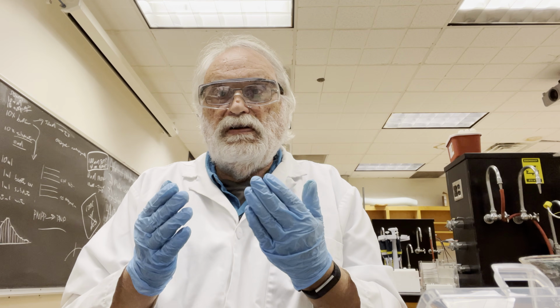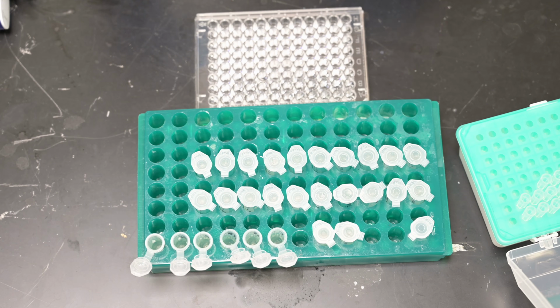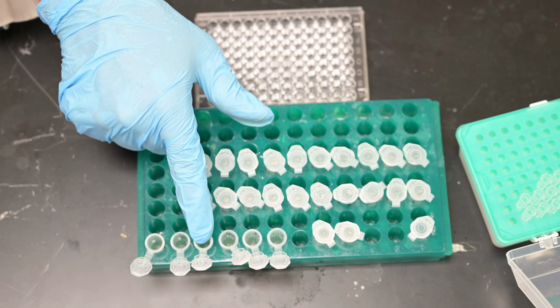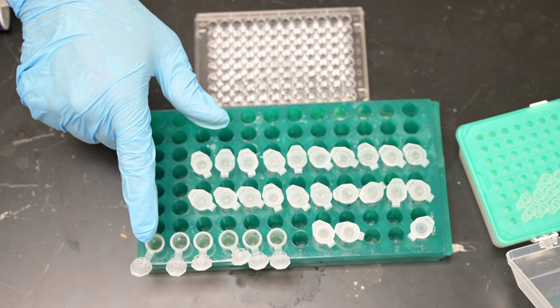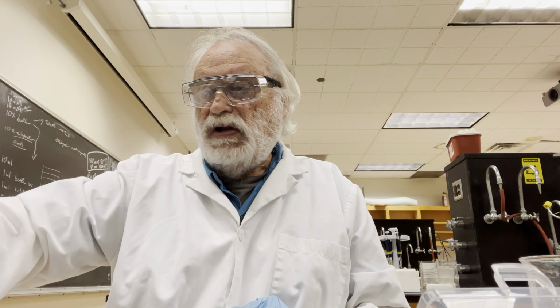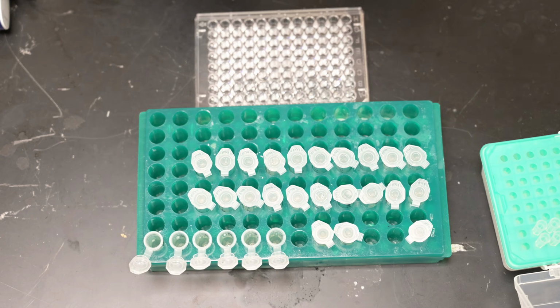The standard concentration of BSA that we have in the solution is 2 milligrams per mil. So I set up a series of tubes labeled 1, 0.5, 0.25, 0.125, 0.0625, and 0.03125 milligrams per mil. So they're all in here. What I'll do here is go ahead and add water. Oops. I'll add water to each one of these.